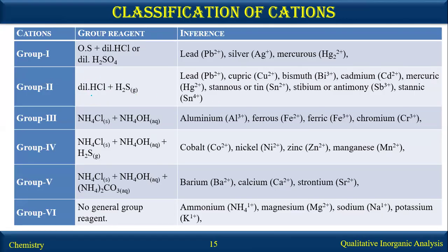And all these tests are performed in the original solution. So the group reagents are there. We add the reagent to the original solution. Why do we perform this? Original solution plus this, original solution plus this, original solution plus this. And group 6 has no specific group reagent.